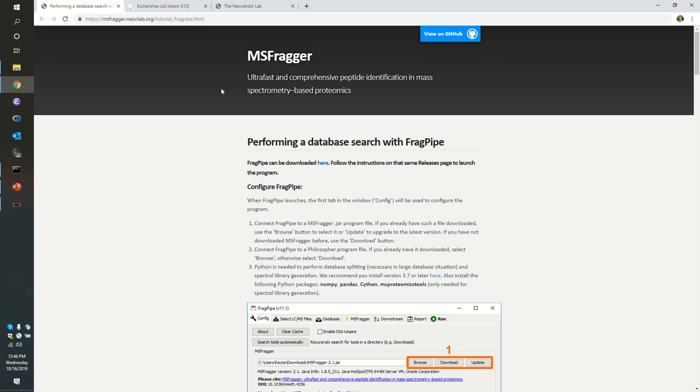All right, welcome to part two. In the first part of this demonstration, we launched MS Fragger via the FragPipe interface, and all we wanted to do was run our search in MS Fragger. We didn't want to run any of the downstream tools.